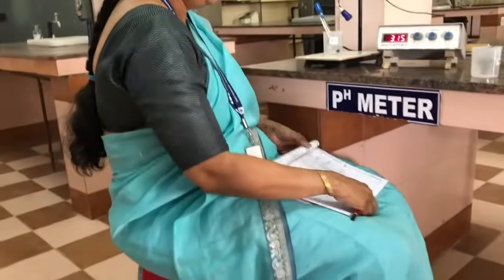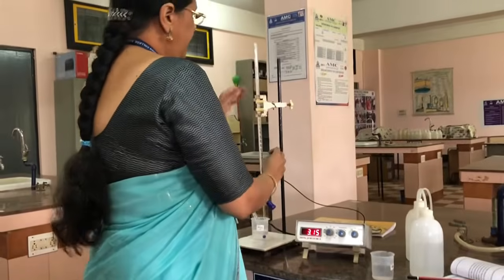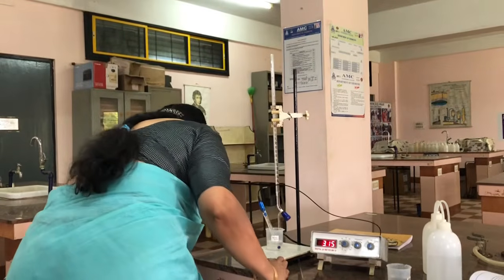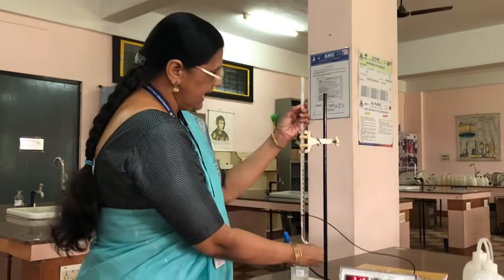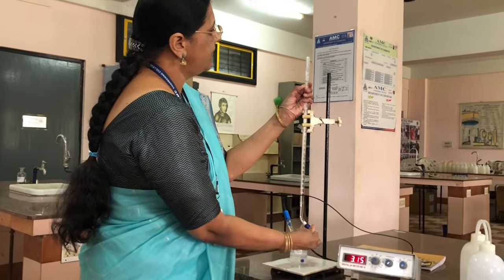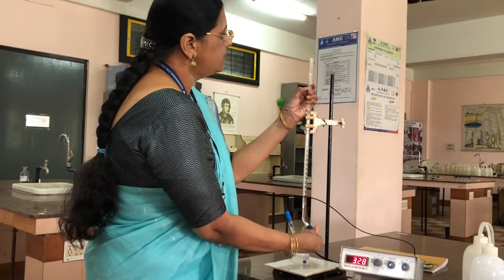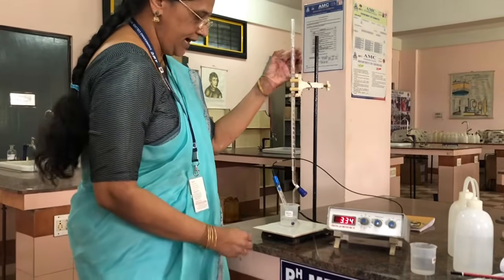Now we have to add sodium hydroxide from the burette slowly. See that we have to add exactly 0.5 ml. Only 0.5 ml. That means from 0 to 0.5 ml of sodium hydroxide we have to add.